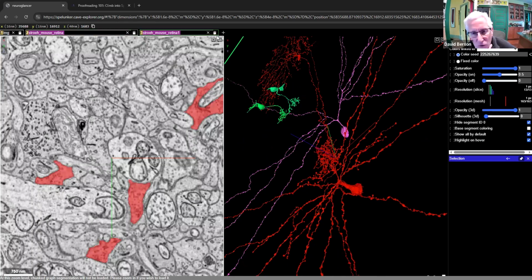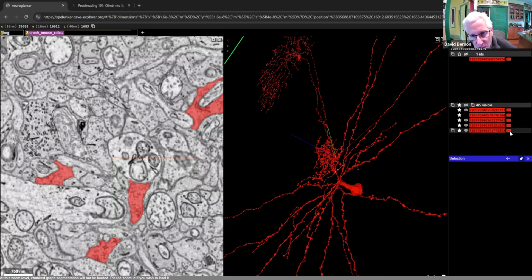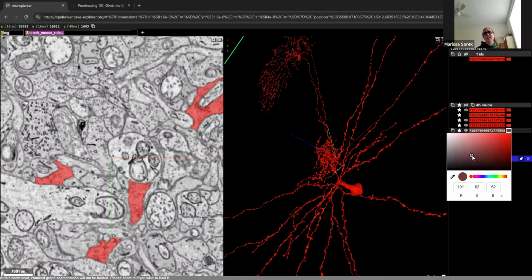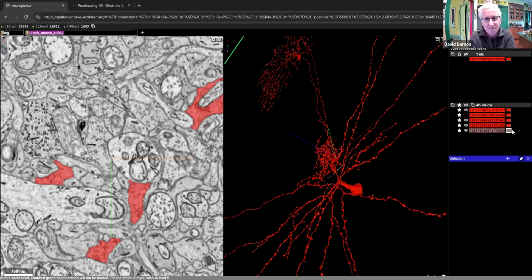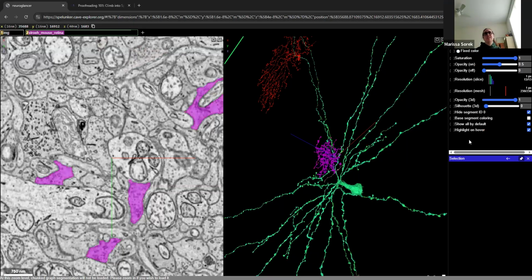But to confirm, if you wanted just one cell out of a group of four to always keep the same color, you want to do it in the segment list by selecting the color you want. Yeah. Okay, and now that I did that for fixed color, let me change that. There we go. And the nice thing is you can easily switch that off if you accidentally do it. You just select over here on this, and you can also change your opacity.